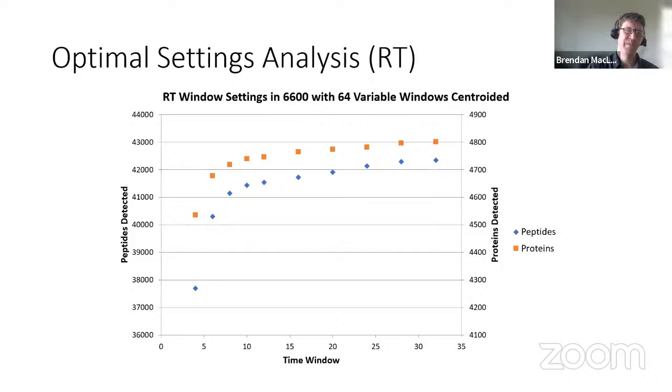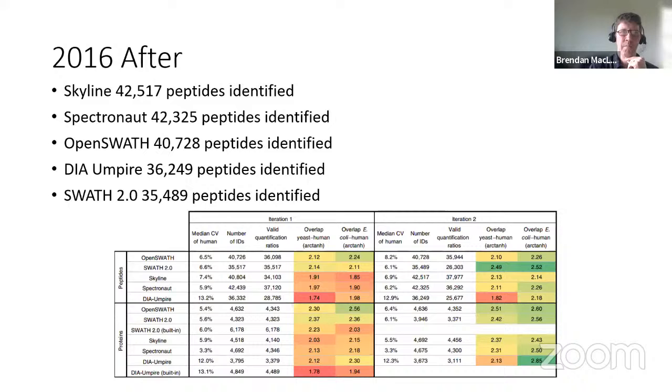and run it overnight. So I really felt like we want to give people this power. And for a while I would teach these courses and say, here's my batch script. And then I realized, wow, half the people don't even know what to do with this batch script. So that's the genesis of Skyline Batch.